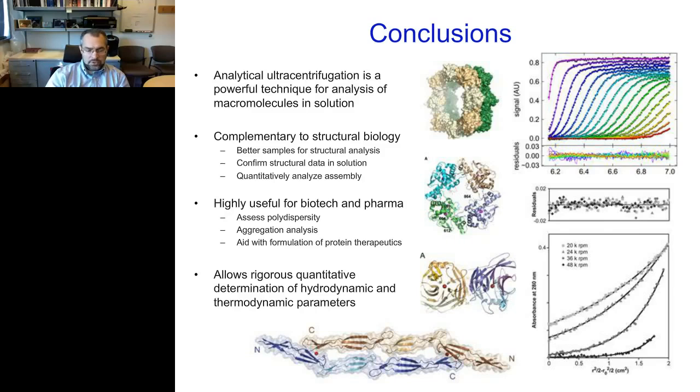So I think one of the guys who's done some beautiful work in this area is Stephen Perkins at University College London, and I'm sorry I meant to include a slide on his work. And also there are programs such as HydroPro by Garcia de la Torre that will allow you to do bead modeling based on your sedimentation velocity data. So I definitely want to put a plug in for those kinds of approaches as well. That's where AUC is directly used for structural biology types of investigations.